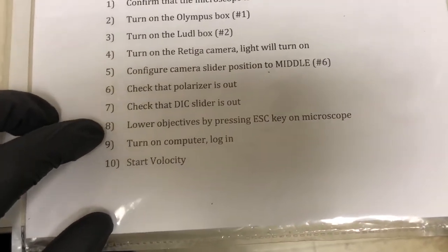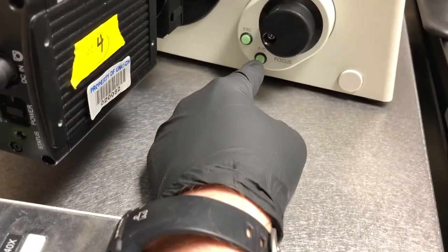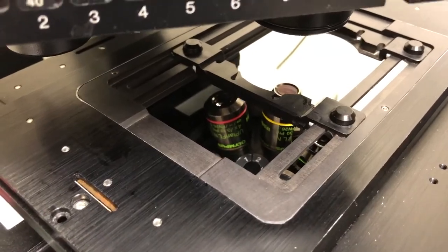Step eight: lower the objectives by pressing the escape key on the microscope. The focus knob on the left-hand side has two buttons: an escape key and a toggle between fine and coarse focus. We need to press the escape key and when we do, the objectives will go down.